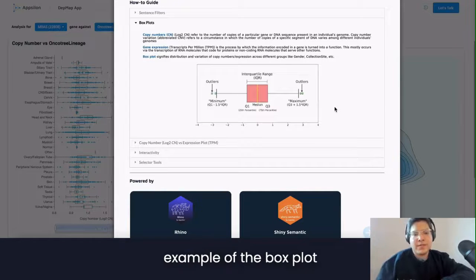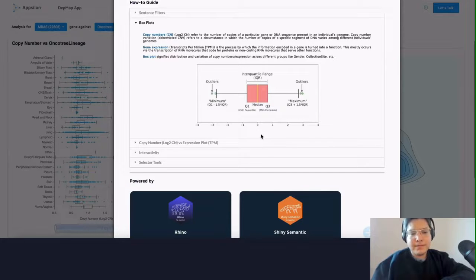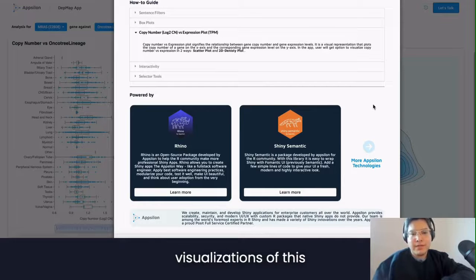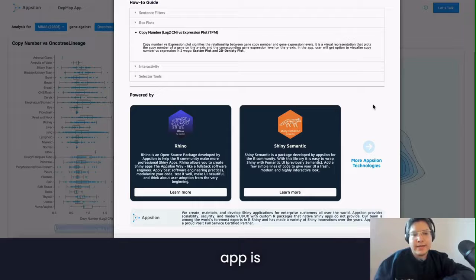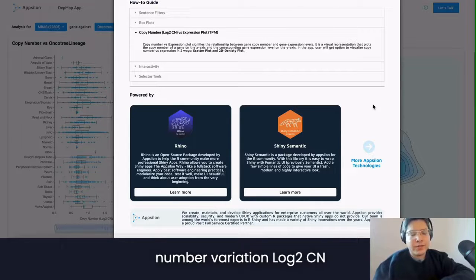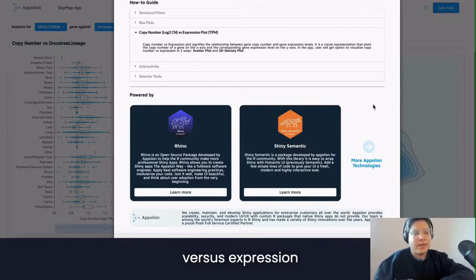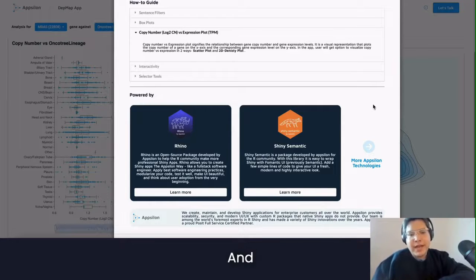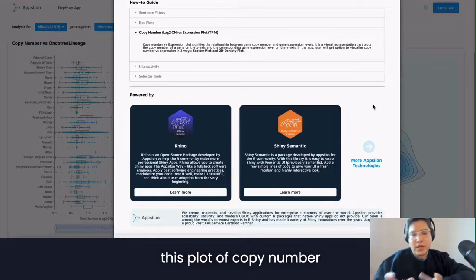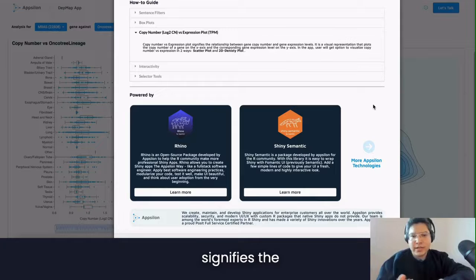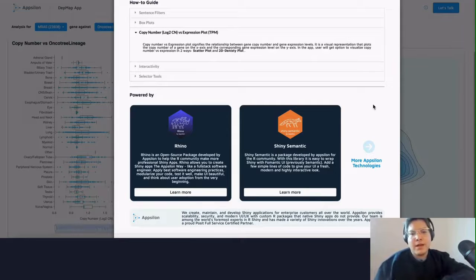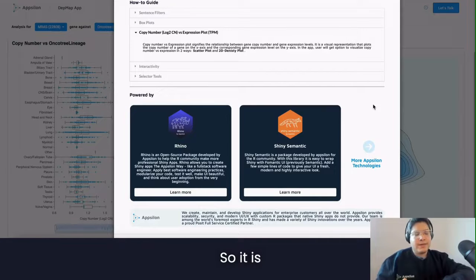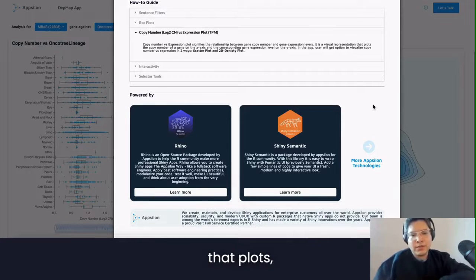Gene expression is measured in transcripts per million, TPM, and is a process by which the information encoded in a gene is turned into a function or a protein. This occurs via the transcription of RNA molecules. Here is an example of the boxplot that you will see. One of the main visualizations of this app is the plotting of the copy number variation log2 CN versus an expression plot in transcripts per million.